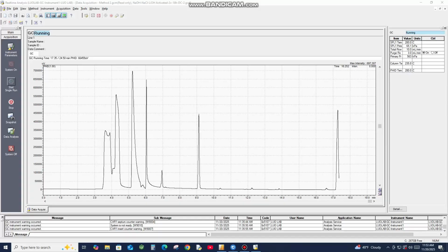After around 17 minutes, we could see a big peak forming, which we previously determined was the peak of aminopyralid by injecting the original aminopyralid molecule. We also saw a peak around 18 minutes, which we previously determined comes from the picloram molecule. By comparing the area under the curve of these peaks, we could determine the concentration of the molecules in the reaction mixture, as discussed in the supporting information of our manuscript. From there we could quantitatively measure how much aminopyralid is forming in the reaction mixture.